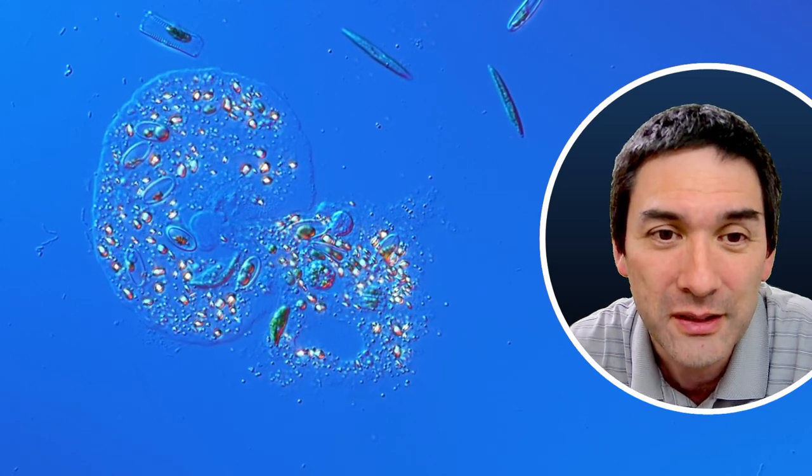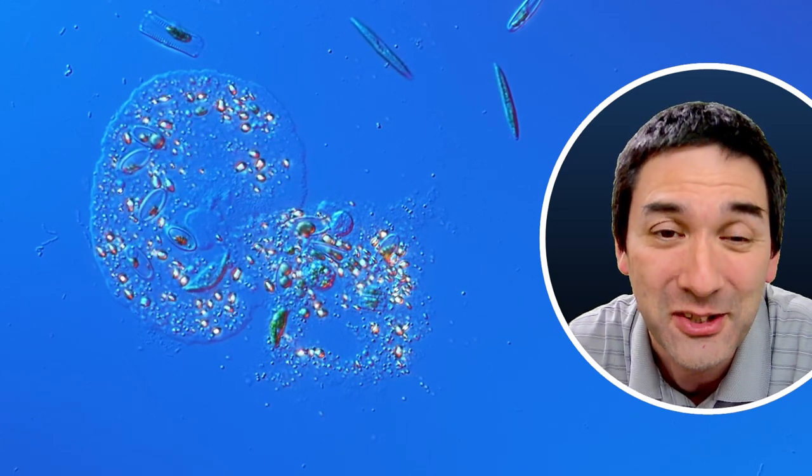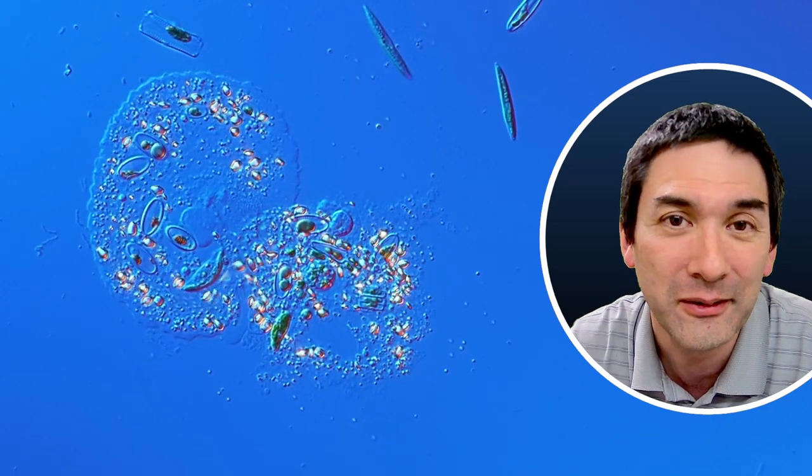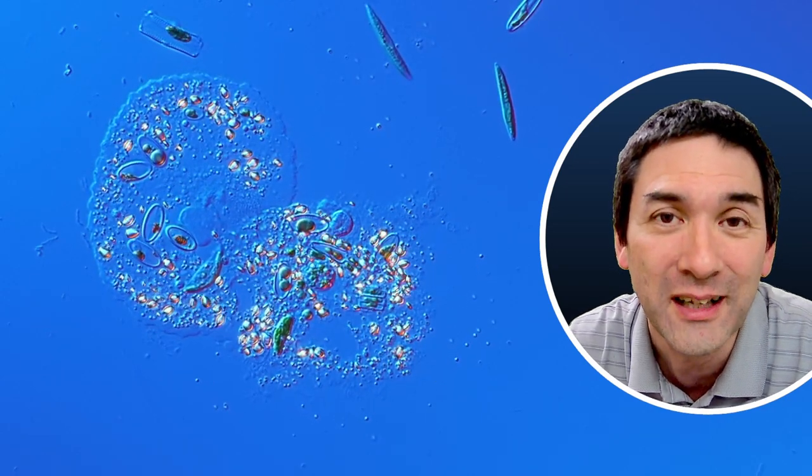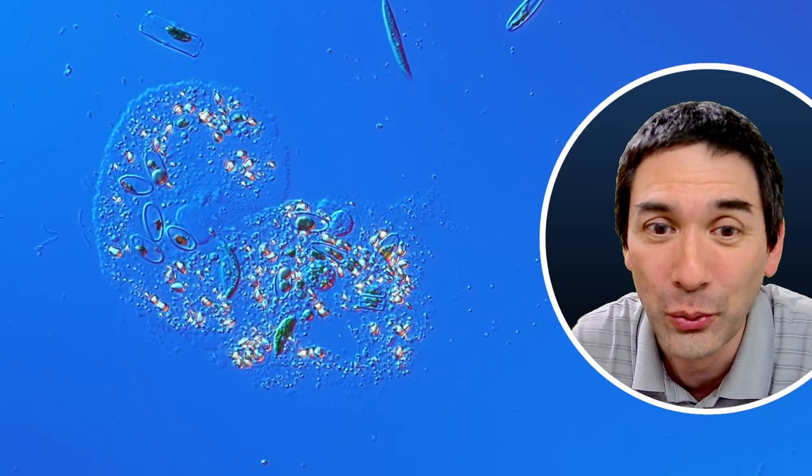So the cell pops open again, and all of the contents are spilled out. But in nature, everything's recycled. So nothing's wasted here. Basically, the contents of this cell is now the food for other cells and for other microorganisms.